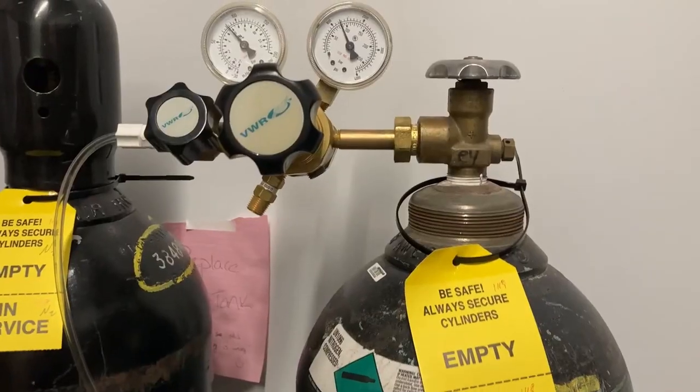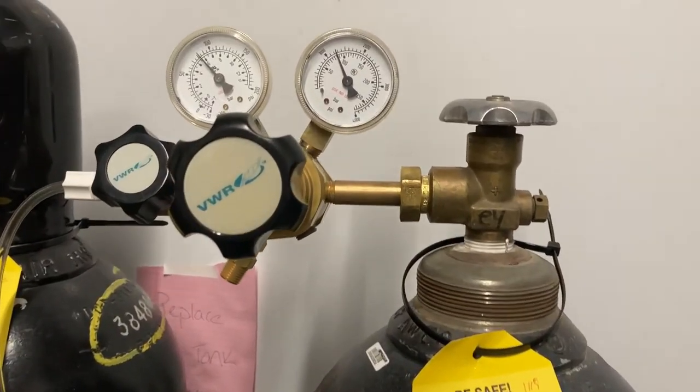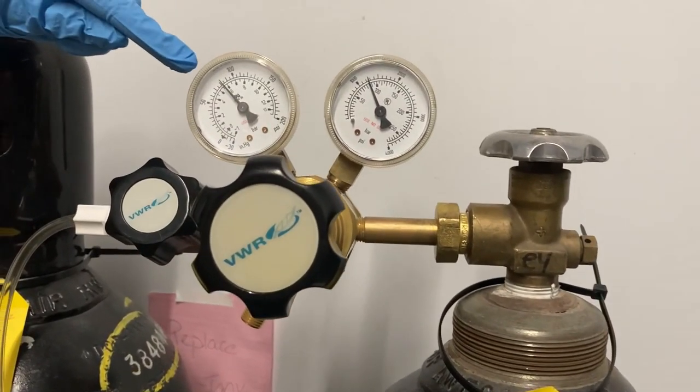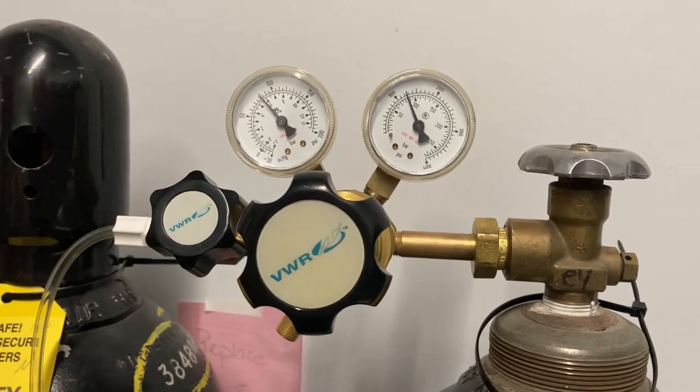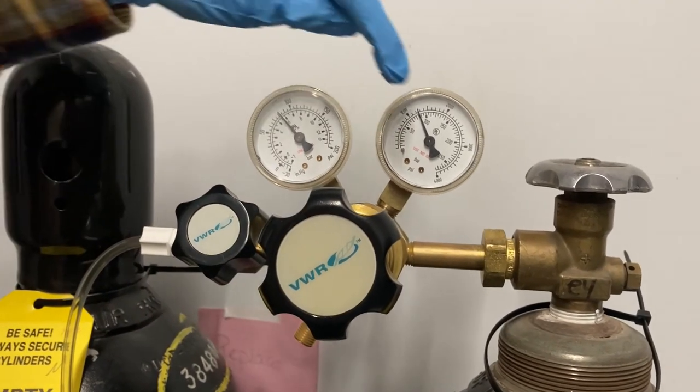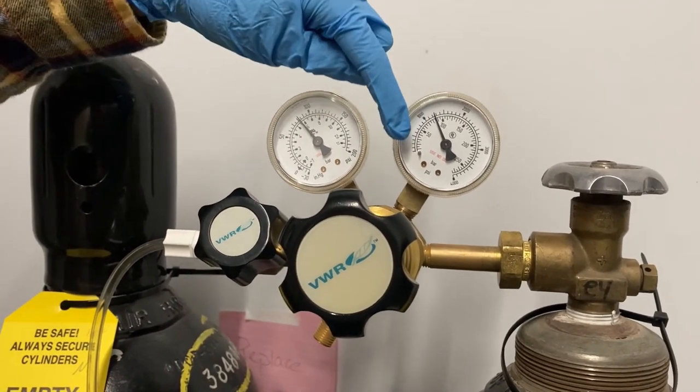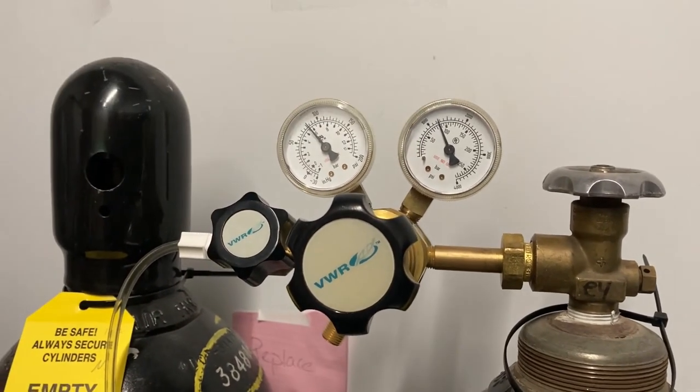If you need to adjust the output psi to 88 psi once the tank is opened, use the adjustment knob. Under the operations tab, open the bottle preparation window.